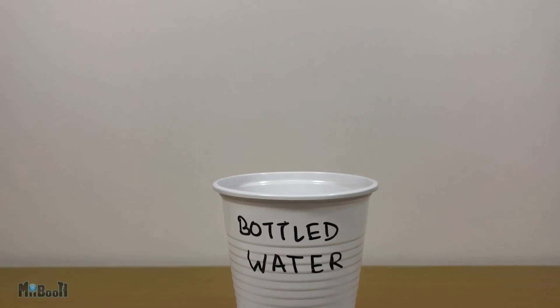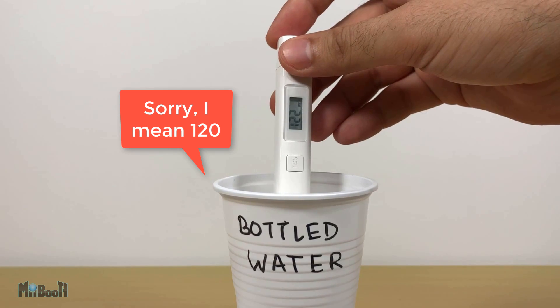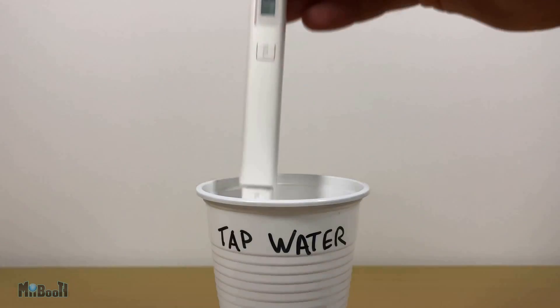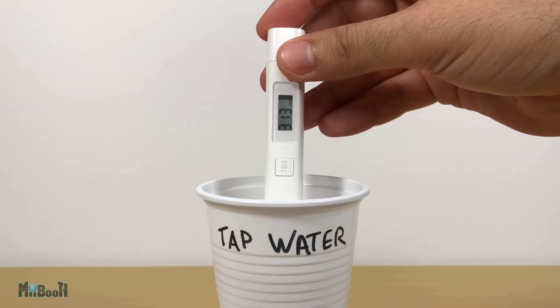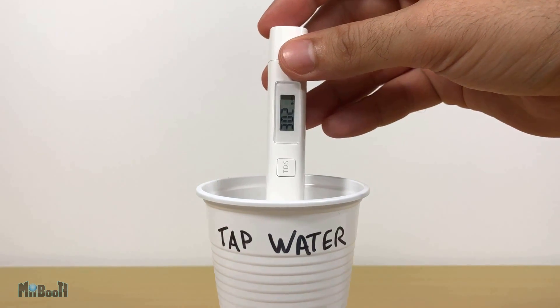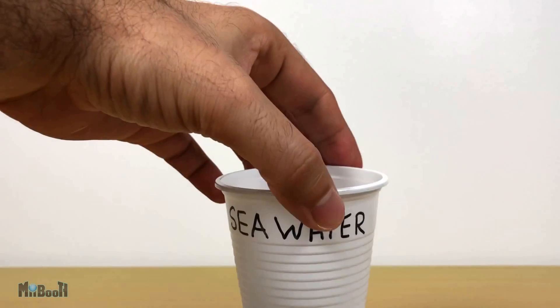Next up I have standard bottled water, which you get in those five-gallon sizes. This one reads 130, which is pretty much the standard for bottled drinking water. Next up is tap water, which to be honest I've been drinking most of my life. This reads about 300 — a little up and down — so still in the very much ideal drinkable range.